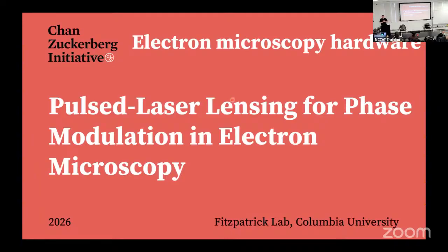And so the way that electron microscopy developed over the years is there's really two branches. There's material science and there's obviously biology, but there's an awful lot of overlap between the two types of microscopy that we use. In material science, they rely more on amplitude contrast.